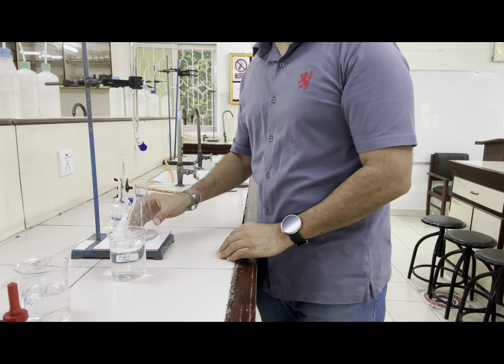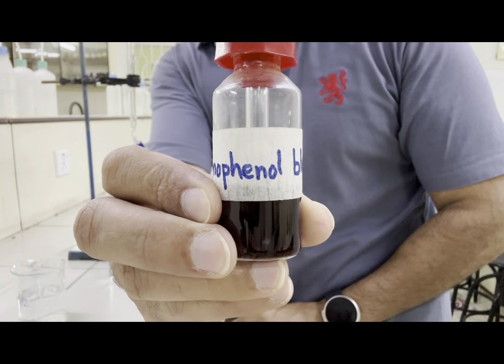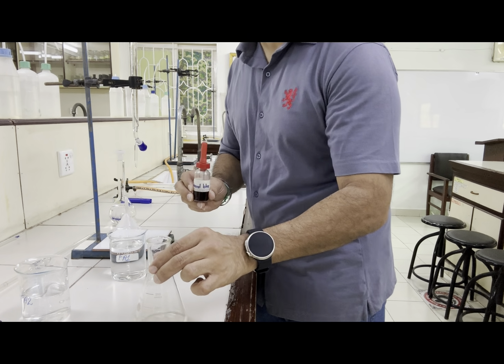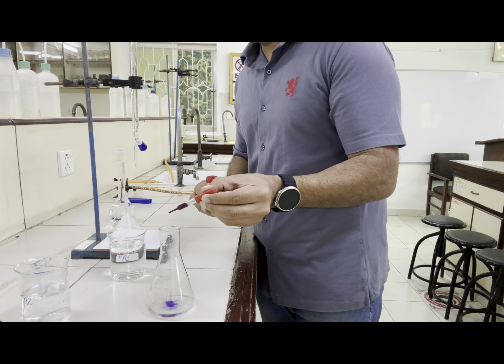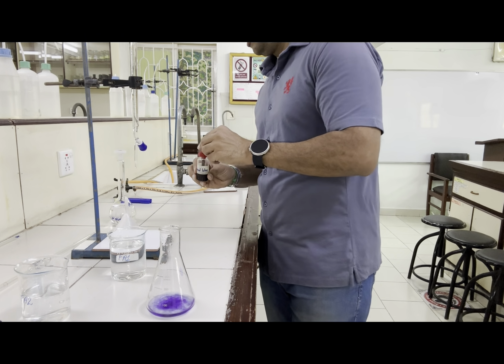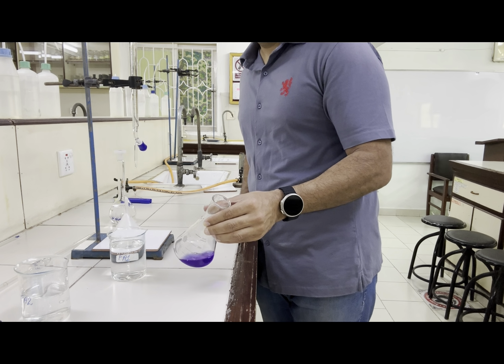Now add 10 drops of bromophenol blue indicator as they have said. So this is our bromophenol blue indicator. Let's add 10 drops here. One, 2, 3, 4, 5, 6, 7, 8, 9, 10. So the solution has turned completely blue. It's a dark blue solution.